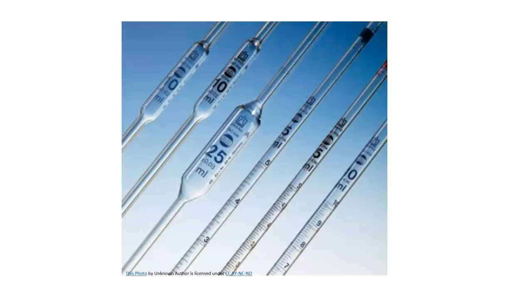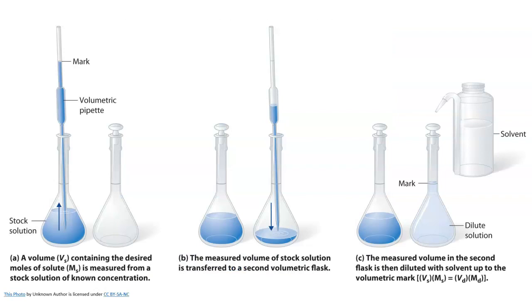All right. So we're also going to use volumetric pipettes. Now, volumetric pipettes deliver a specific amount of liquid to a degree of accuracy. So you're going to rinse the pipette the exact same way. Place the pump on the top, roll it up, pull the solution up, and discard it into a waste container. Again, I will show you how to do that while we're in class.